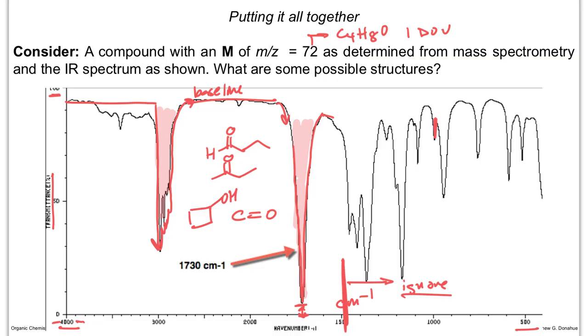So given this spectrum, because that signal is present, there has to be a carbonyl, which means the OH is not present. And the OH occurs in another part of the spectrum, and it looks very different. I mean, it sticks out like a sore thumb. So when I look at this, I know it's not there, and I can say, okay, the molecule is not an alcohol.